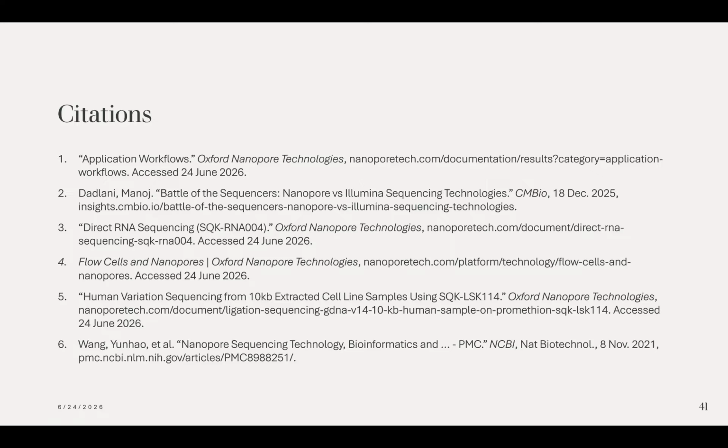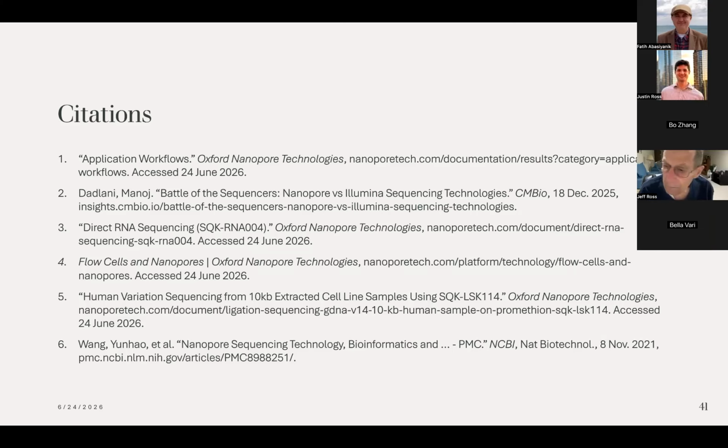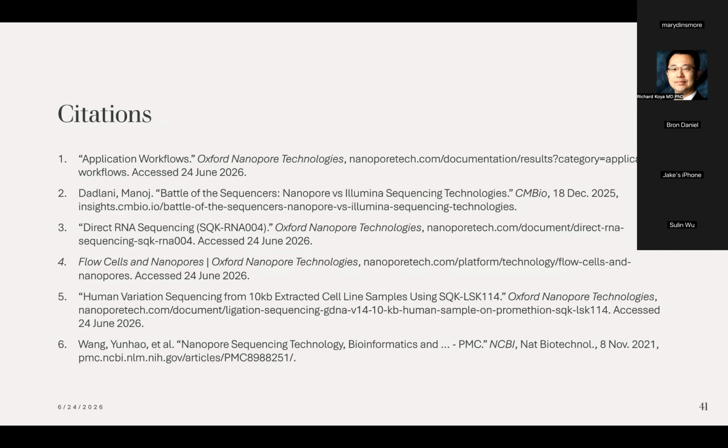Just with some tweaking. And I understand that might still be a lot. The reason that it's so much is because a lot of these protocols avoid PCR so that we can preserve that native DNA. We can, of course, do a PCR step, and then the input is 10 nanograms, 50 nanograms. But if we want to avoid PCR, then yeah, we are probably going to ask for about 250 minimum.